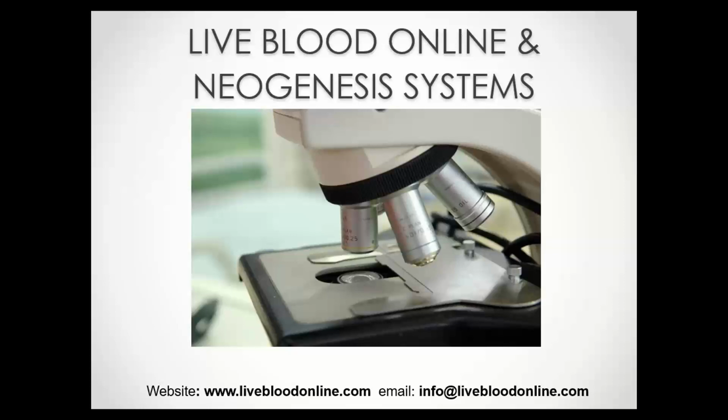Unfortunately, the specifications that are required are quite costly. It's not an entry-level type of microscope at all. The optics need to be very high quality. The light source needs to be very strong and very bright. And there's a specific type of condenser and so on that needs to be used as well. So these are not entry-level specifications, and as a result, these systems tend to be quite costly.